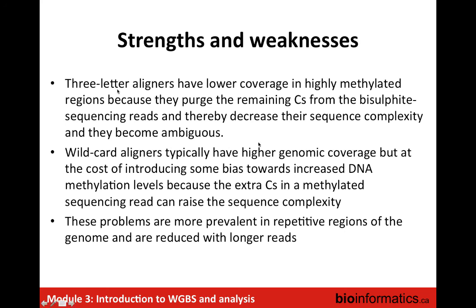The three-letter alignments have lower coverage, especially in these highly methylated regions. Highly methylated regions have lots of C's, and so these regions end up being very low complexity, given that we've changed the alphabet, because of the three-letter alphabet. So you end up decreasing coverage a little bit in these regions of low complexity. Again, the longer the reads, the less this is an issue, but it's still an issue in some regions of the genome.